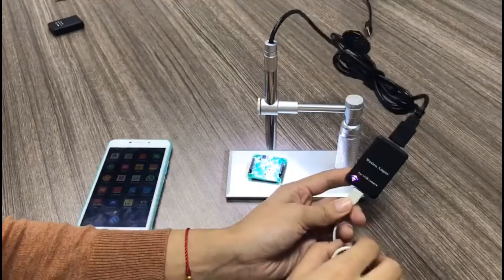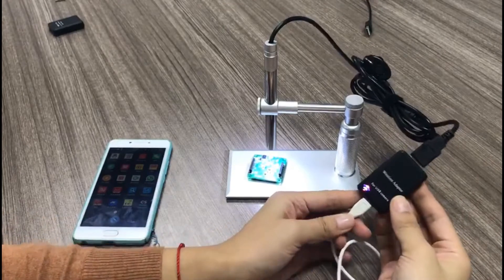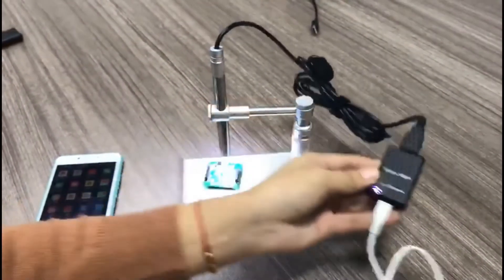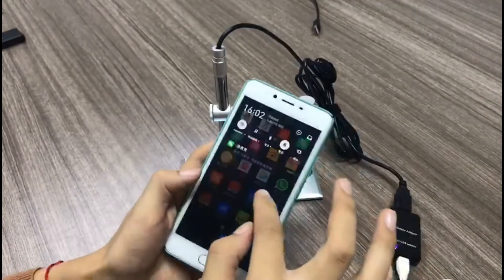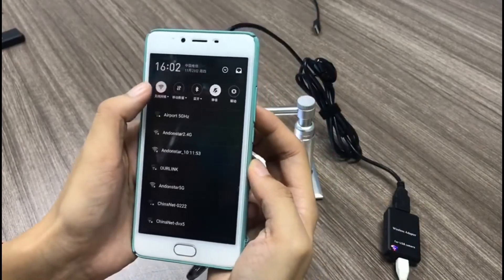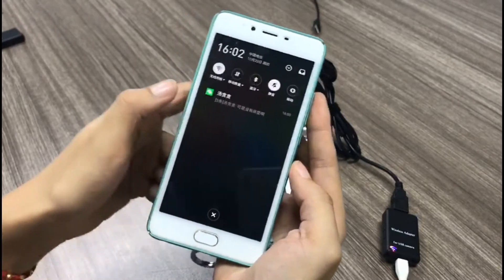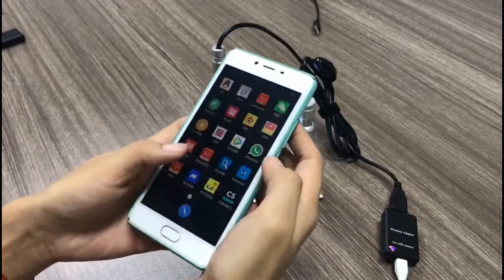First, you connect everything properly — USB camera to the Wi-Fi adapter, and Wi-Fi adapter to the power supply. Then you open your phone and look for the Wi-Fi signal. Our device name is usually something like 'AndoStar' followed by some random numbers. You link it and the password is 12345678.